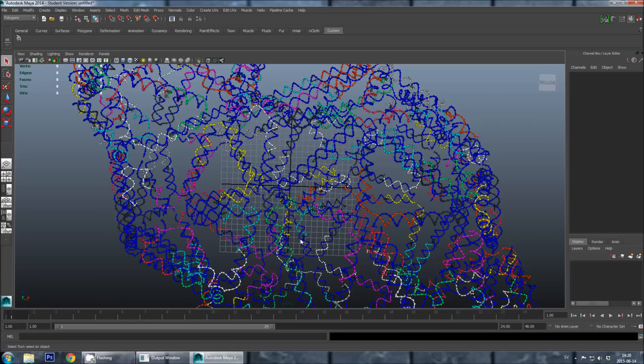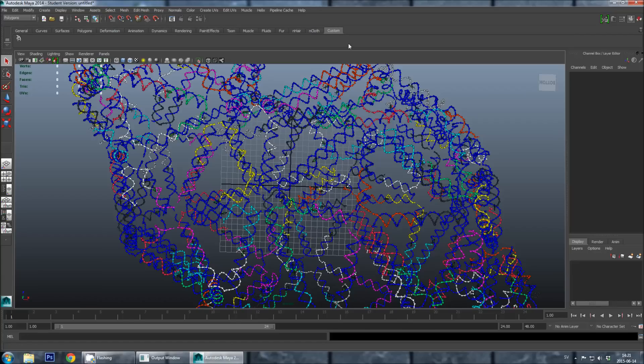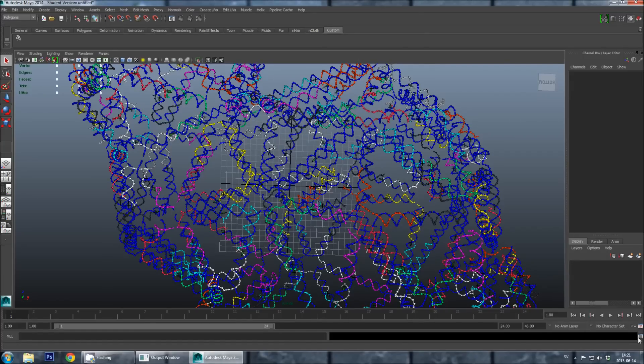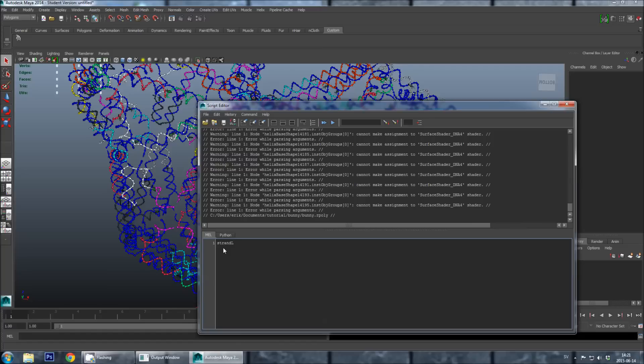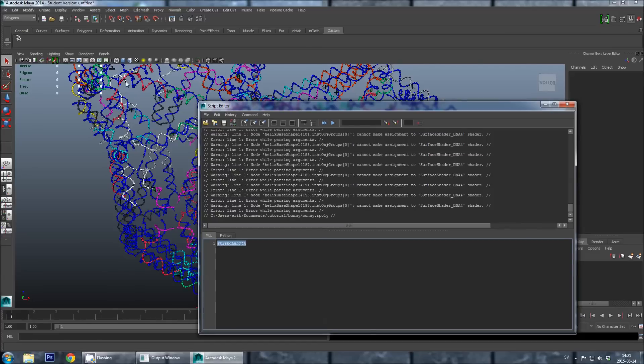Before I start modifying the staple breakpoints on this design, I will show you a useful V-Helix feature. And this is accessed from the script editor. But what you must first do is put your shelves into the custom shelf. And then you must start the script editor by clicking this little button in the lower right corner. And please make sure that you are in the mel tab of the script editor. And then type strand, and then with capital L, length. And now it turns blue because this is a script. And highlight this.